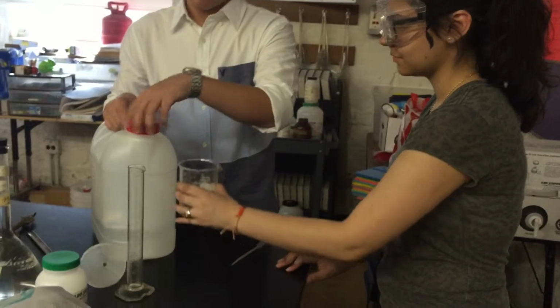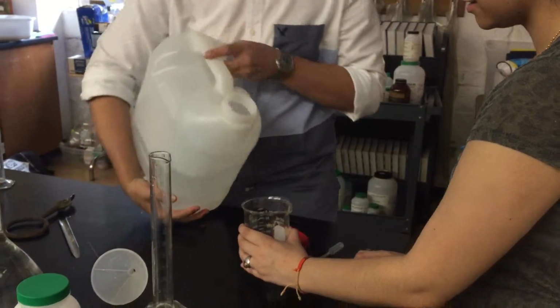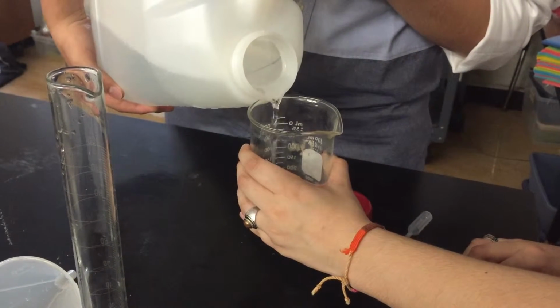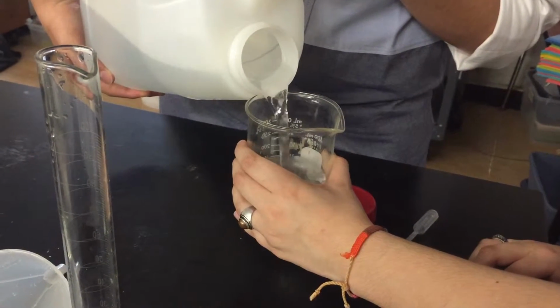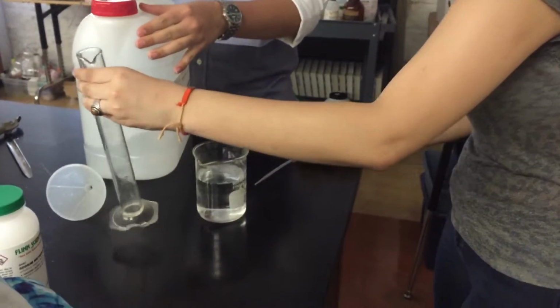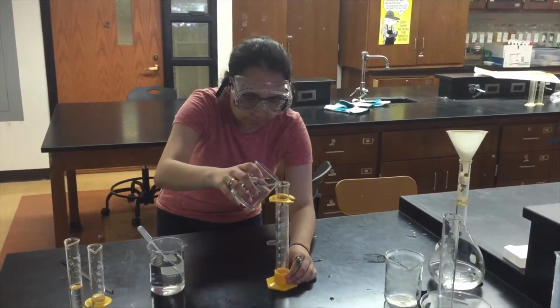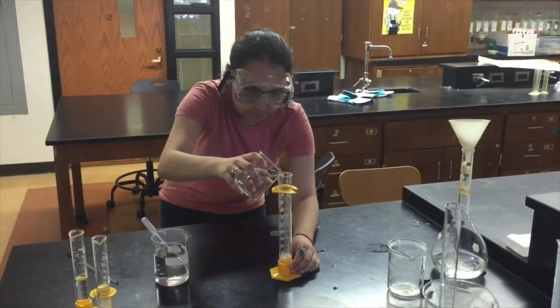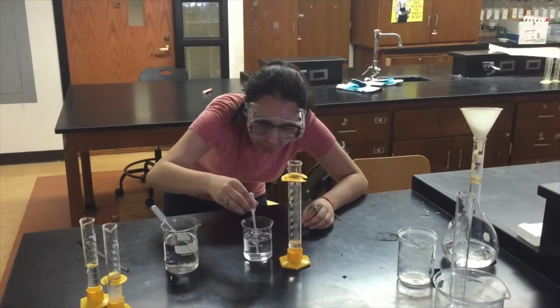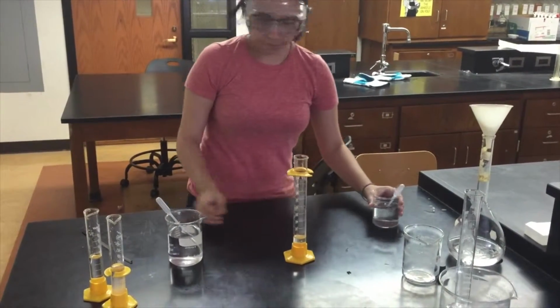In order to create different solutions of potassium iodate, we will take the stock solution, which we will then dilute. Iris is now creating one of our few potassium iodate solutions using the M1, V1, M2, V2 calculations that we did to make sure that we had correct and ideal molarities for the iodine clock to work properly.